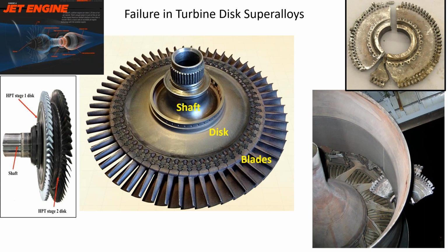One of the examples shown on the right side is a real accident in the aircraft industry that happened quite a few times in the last 10, 20 years. So disc failure is very rare, but it's not that uncommon. The failure could be due to several reasons. One of them is an impurity level, or some of those levels, internally there could be some oxidation. And that's what I was going to look at here. This is an industry-funded project which went into atomic level type of work. So I'll share some of the experience with that. So next slide.